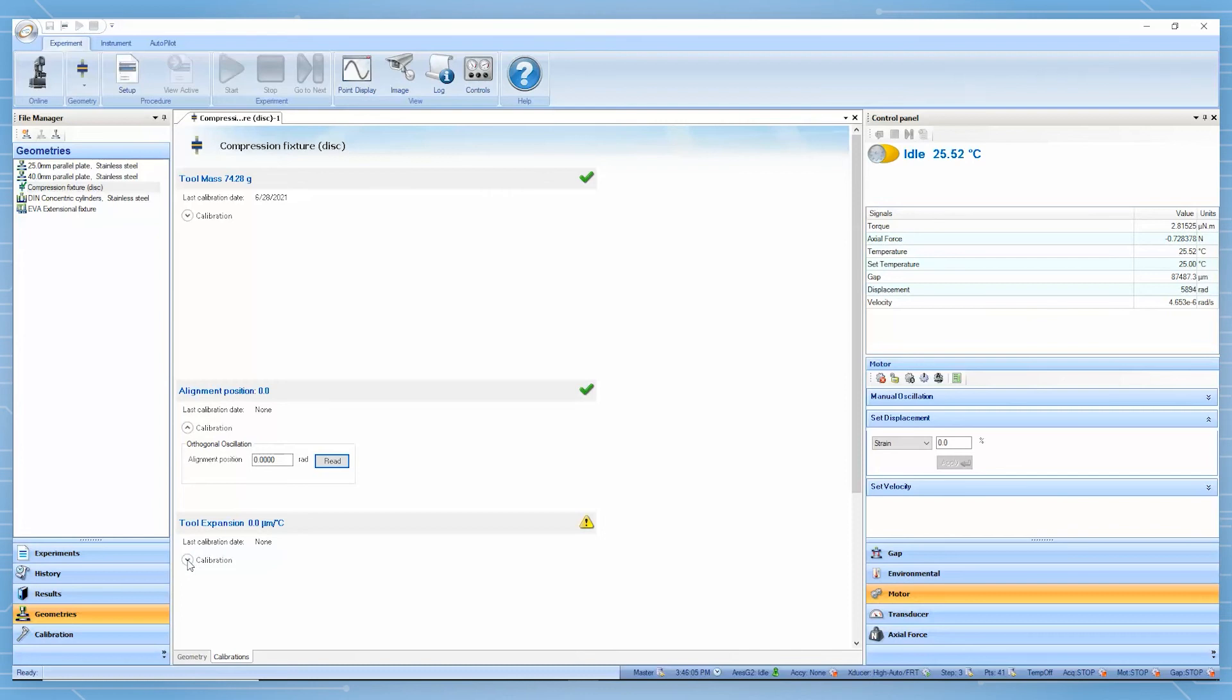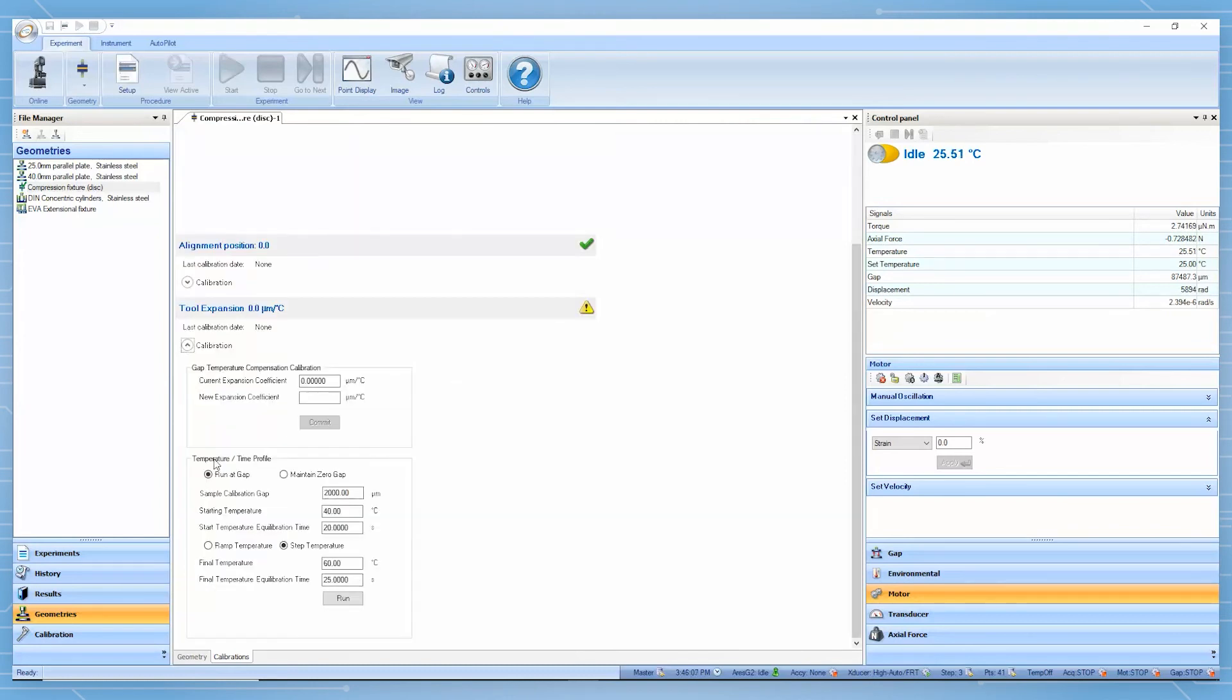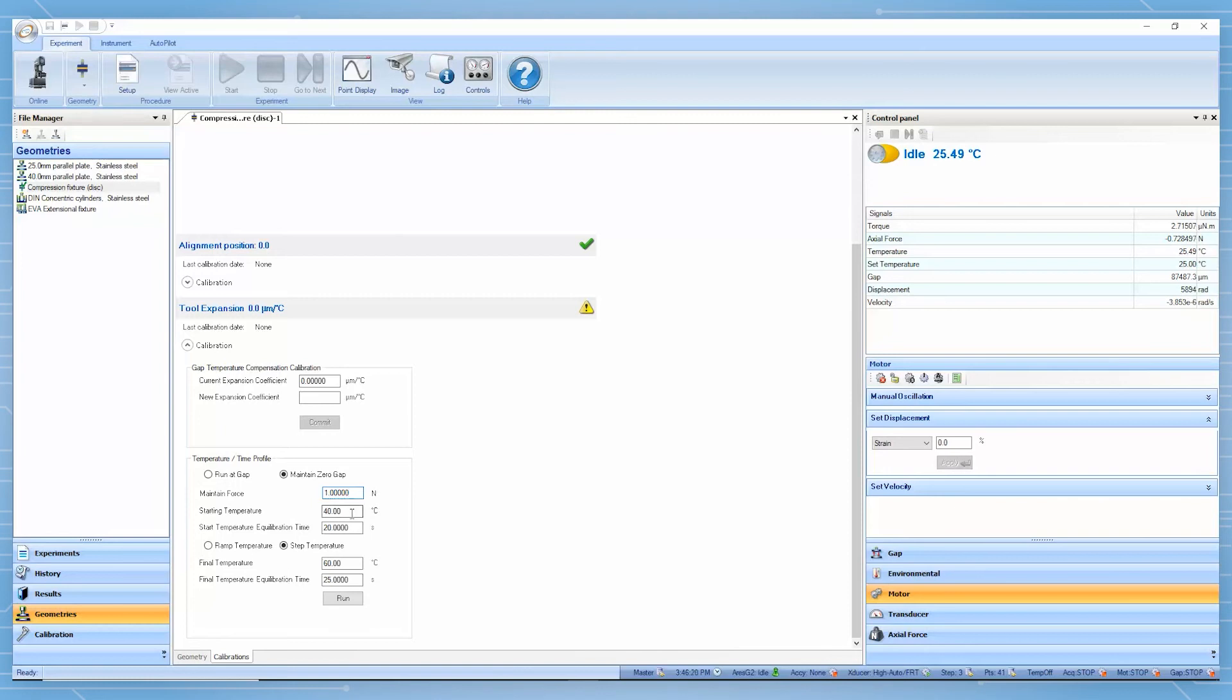The third calibration is the tool thermal expansion. We can select to use maintain zero gap at a constant force of one newton. The temperature range and heating rate needs to match the same conditions as required for sample testing.